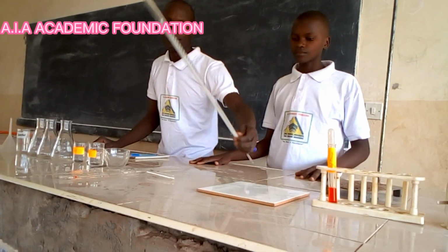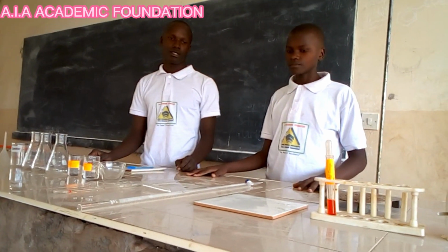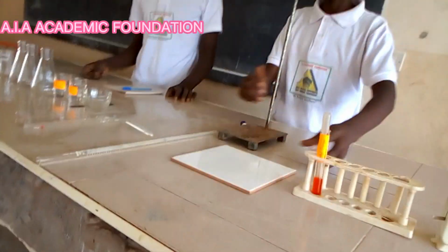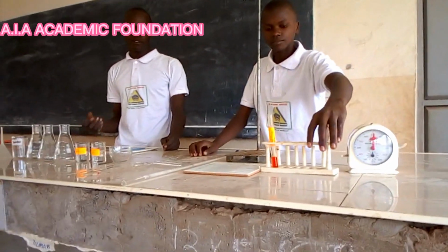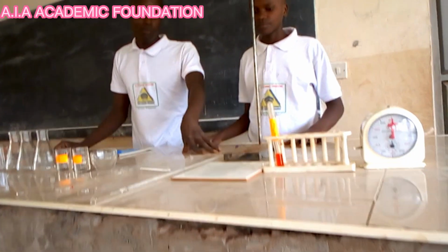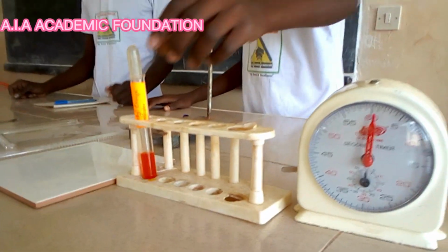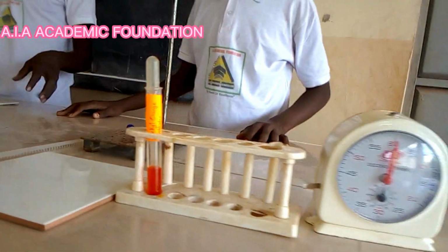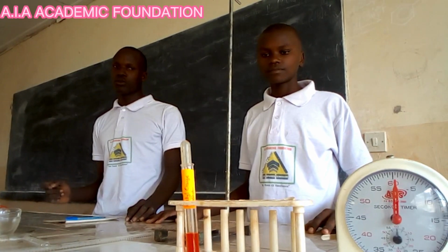We shall also have the burette, which we shall put the hydrochloric acid in during the measurements. We have the white tile, used to show, as we all know, that white surfaces show the color clearly. We have the test tube rack involving the dropper and the test tube, which also has the solution known as methyl orange, which will be used to show if there is acid or base in the solution which you are going to make.